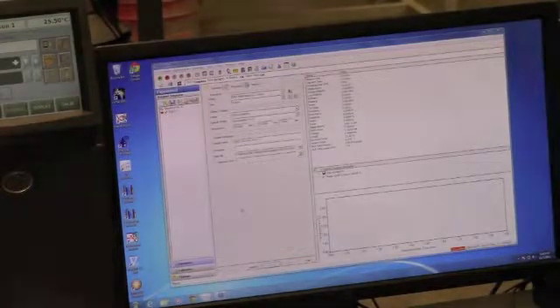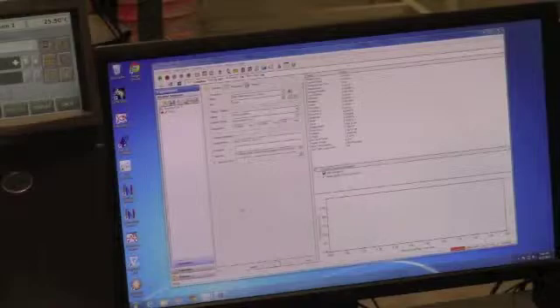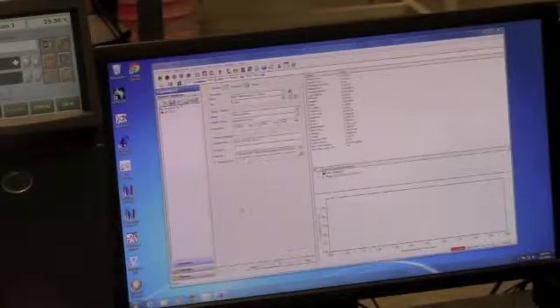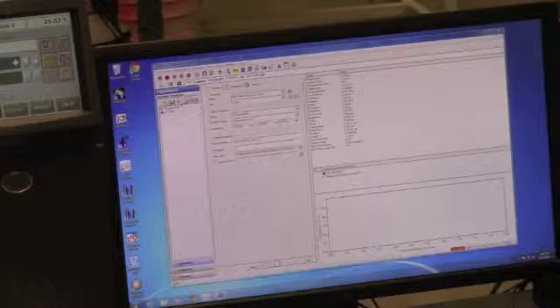After an operator is comfortable setting up an experiment using the Experimental Wizard, additional experiments can be set up by simply going to the Procedure tab on the main page of the DMA interface.